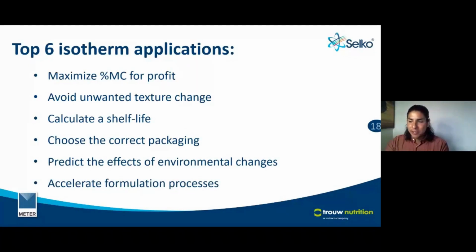And then the last point here is accelerating formulation processes. By using isotherms, we can model new products or new formulations before they're even made, so that we can understand how the water will behave in that new product before you even make it.